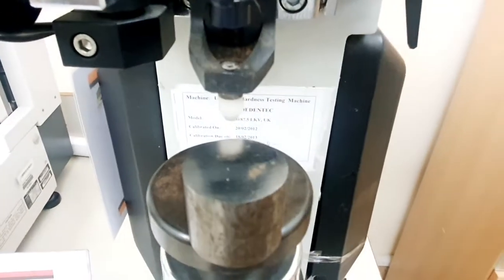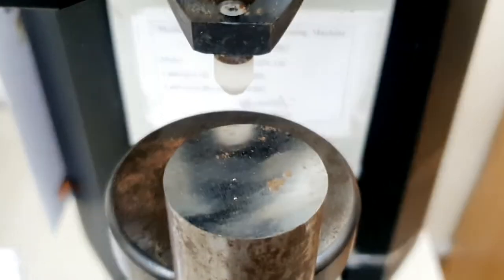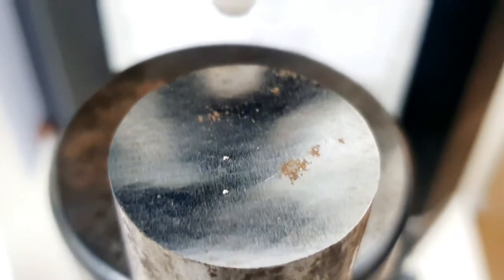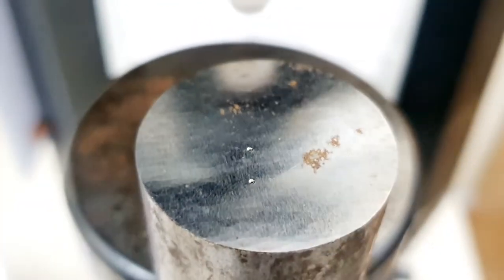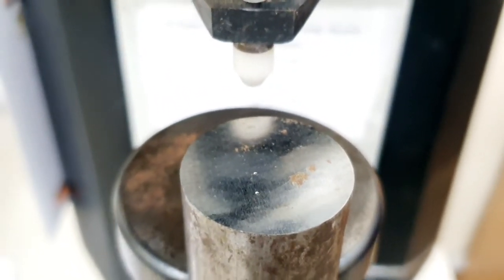In Rockwell hardness testing we do not need to measure the indentation by micrometer or microscope afterwards. We can see the indentation marks here are very small, and these are measured by the machine automatically by taking the depth of these indentation marks. We have two indentation marks and have now calculated the readings.